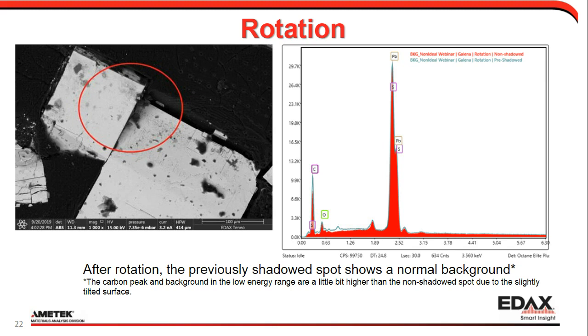So fluorescence in and by itself is not a problem when all the other constraints of the quantification model are met. It's when absorption and fluorescence happens outside what we believe to be the spectrum area, then it becomes a problem and you can get relative changes.